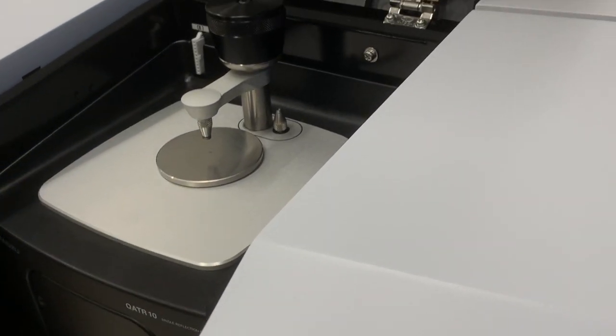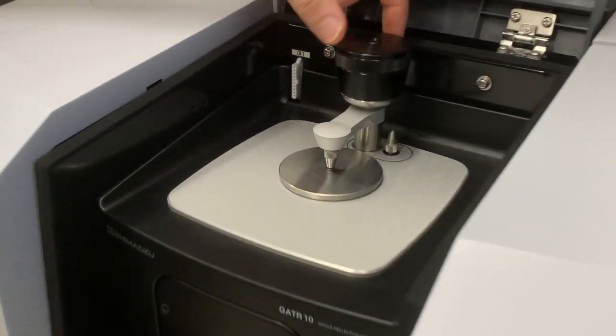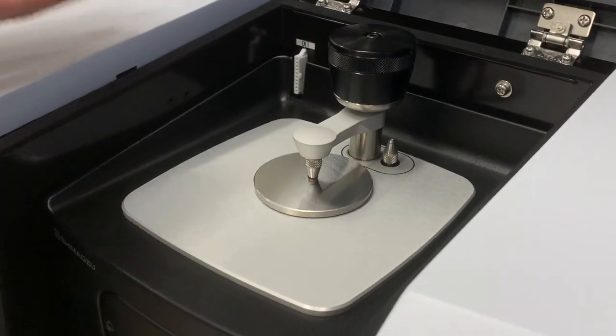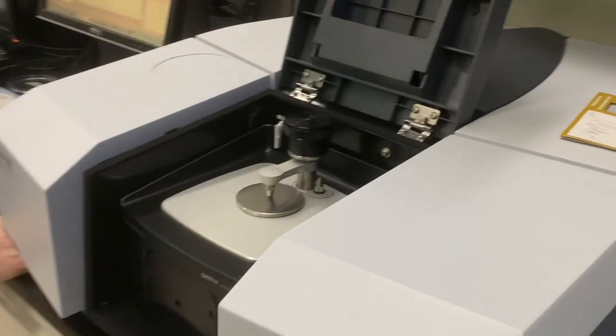That makes sense. So we're adding the sugar to the ink as a coating. So you touch and then you go until you hear the click. You can feel it. Okay. Wow. It's torque based, so it will go to a certain pressure and now it won't go any further. Gotcha. That's really, really cool. How much pressure?